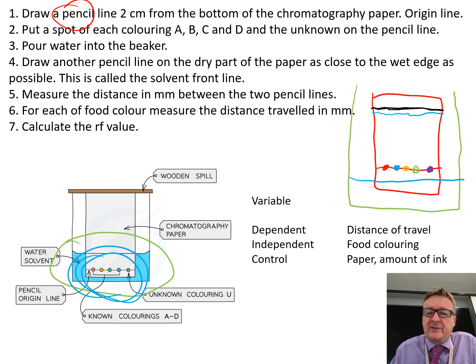Measure the distance in millimeters between the two pencil lines, from there to there. You measure that distance in millimeters. And measure the distance for each food color in millimeters again. If I just do the purple one—the purple one's gone that far.